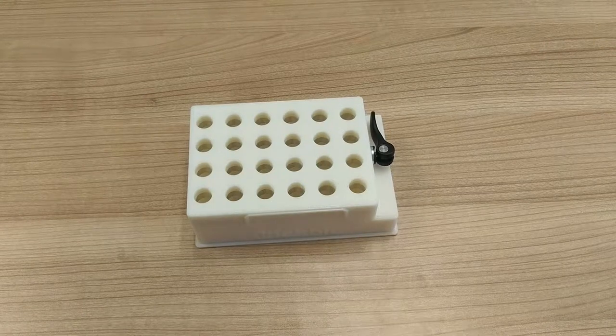The clamping tube rack is a custom piece of labware from ClickBio. With a standard SPS footprint and a standard 24-well layout, it is compatible with most liquid handler robots.